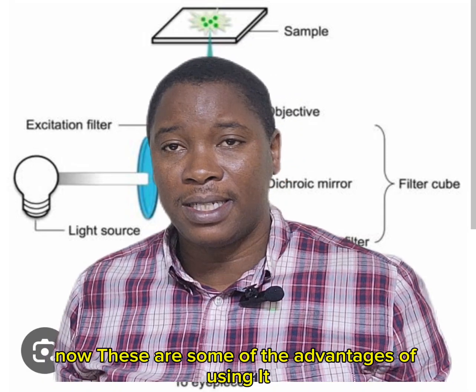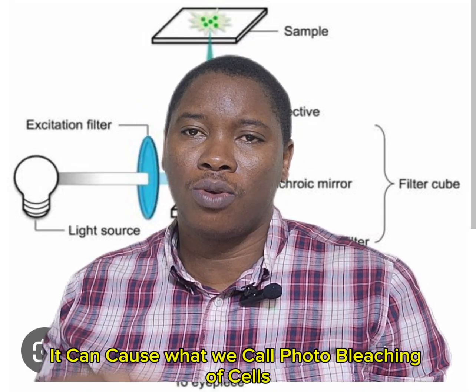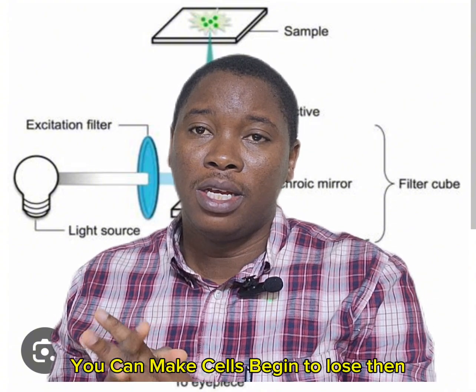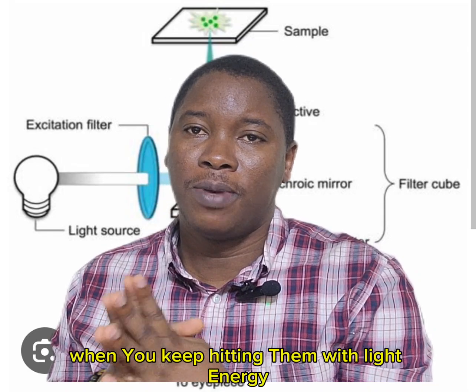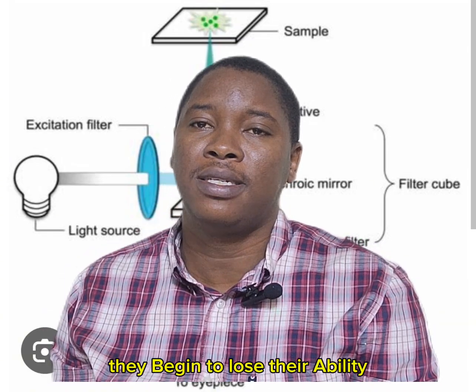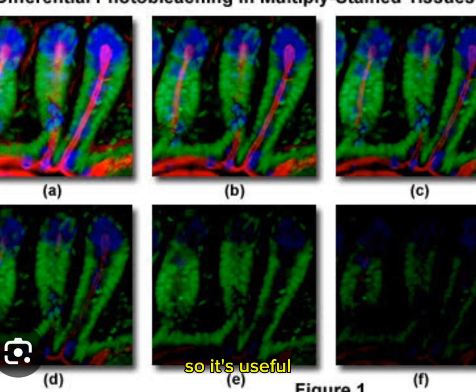Now, these are some of the advantages of using it, but it also has its own disadvantages. It can cause what we call photobleaching of cells. The fluorophores present in the cell, when you keep hitting them with light energy over a long period of time, begin to lose their strength and their ability to glow in the dark.